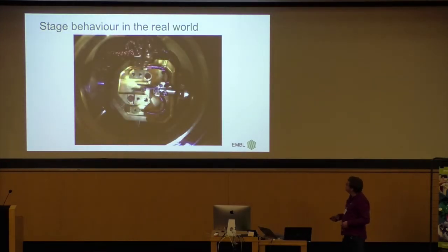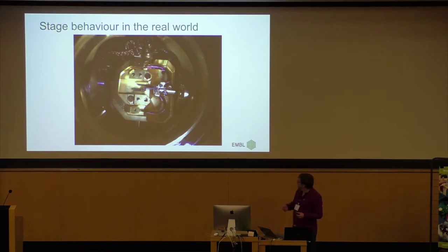This is how it actually looks in the microscope. So these are braids, these are just little tiny wires. Luckily long enough, but still if you go to 70 degrees, there can be some pull on these wires, which is often problematic.